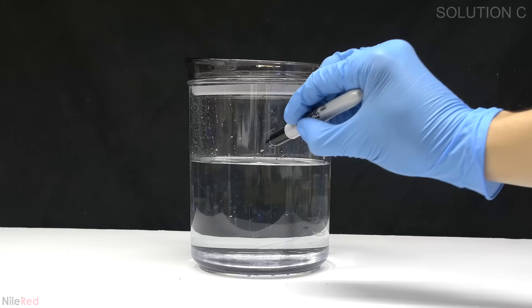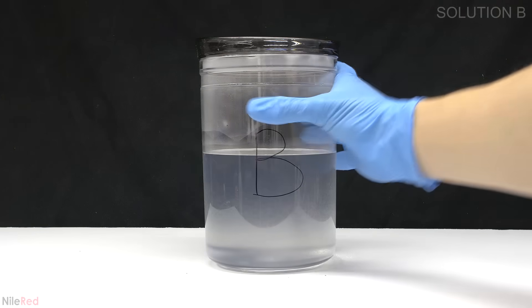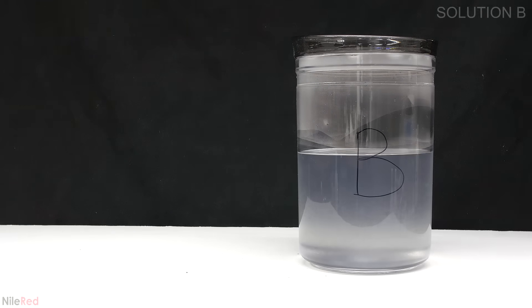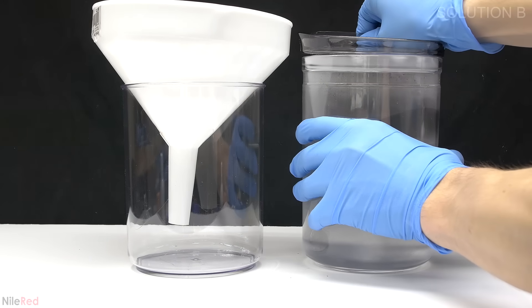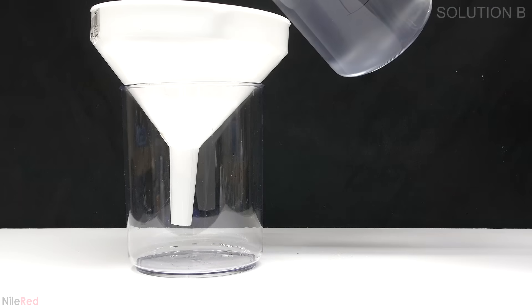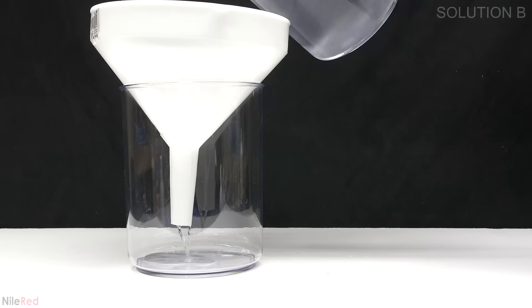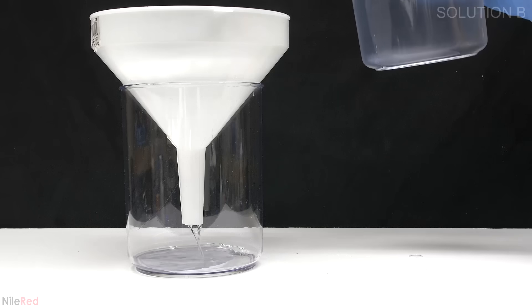At this point we should be done but there's actually a problem with solution B that I need to attend to. In solution B some starch started to fall out of solution and this needs to be filtered off. This is very easily done by just passing it through a coffee filter. The starch solution was quite hot when it was added so it heated things up. As the solution cooled the solubility of starch decreased and it started to precipitate.